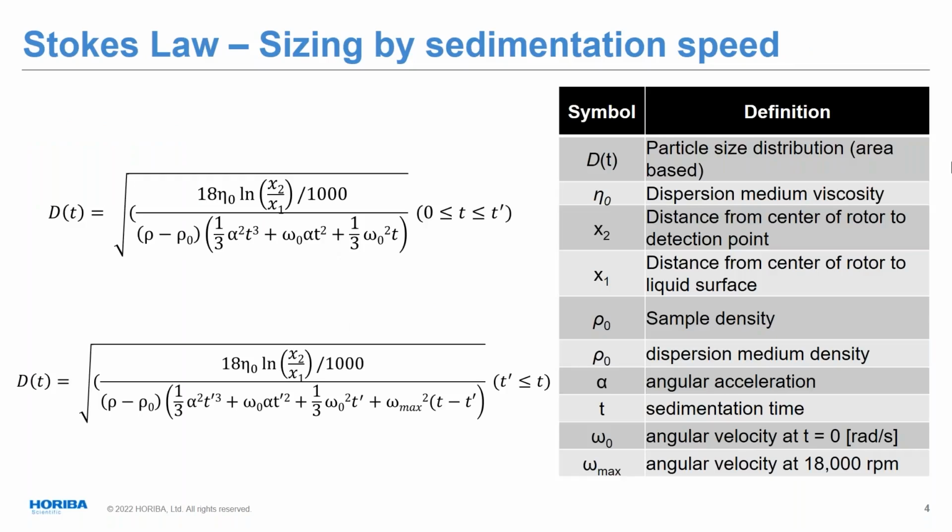Okay, so here what we're looking at now, we've come around to where we're going to focus really on the centrifugal sedimentation. To be honest with you, most of the particles that we look at nowadays are very small, number one. Number two, very often very low density materials, and when I say low density, I mean close to the density of the fluid itself, maybe water in most cases. And so if you tried to do this with the first equation where we only had 1 g of gravity, you could be spending hours waiting for this sedimentation, or creaming if there was an emulsion that rises up. Again, most people don't have that kind of time. We're hoping to get an answer for you in 5 minutes or something like that.